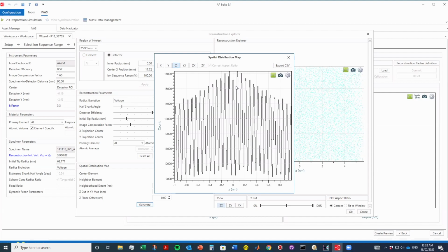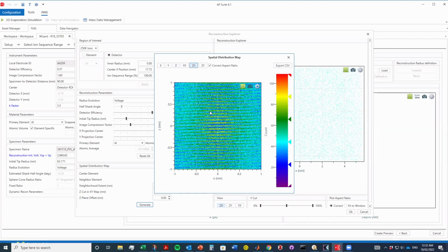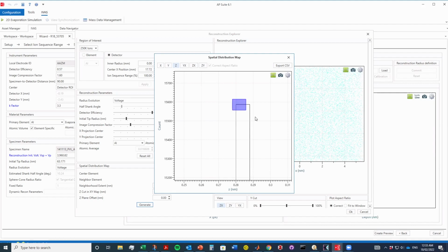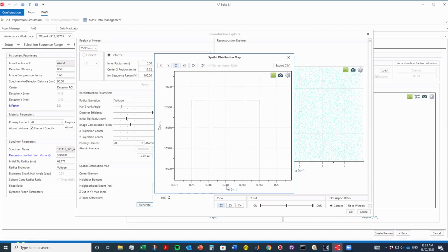Yeah, and that looks super clear as well. So you can see you're clearly getting the planes there. So we carefully look for the central peak, and then we count out to a couple of peaks or whatever. So yeah, we can go 1, 2, 3. This is a nice sharp peak, 4. So I'm going to select the 4th peak there. Have a look at the center of it. 0.284 divided by 4.